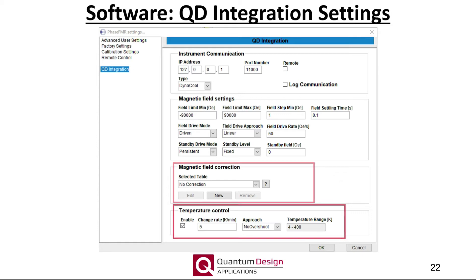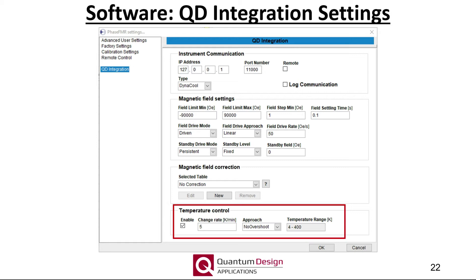As long as the subsequent measurements start at low frequencies and therefore small fields, the resulting field errors will remain small and one can confidently select no correction as shown. Finally, in the latest version of the Nanosk software, the ability to also enable temperature control of the PPMS via the sweep table has been included. The indicated parameters are generally good for most situations. Note, for the PPMS EverCool and DynaCool systems, the base temperature is 4 Kelvin due to the added heat load introduced by the cryo-FMR probe and necessary RF power. For the VersaLab, the base temperature is 55 Kelvin. Once finished, click OK.